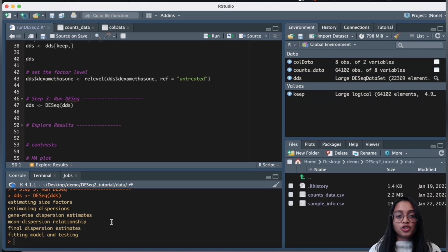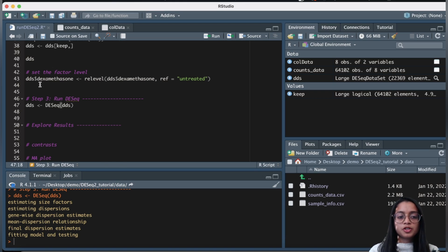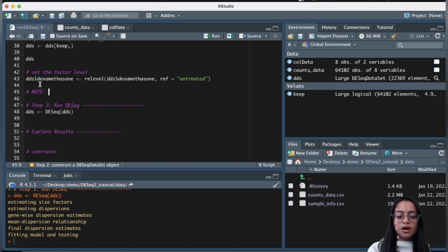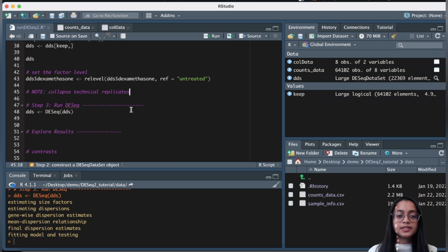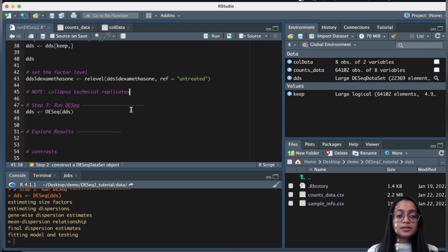Before we explore the results, I want to make a note about technical replicates. If our dataset has technical replicates, we need to collapse them before performing differential expression analysis. DESeq2 provides a function called collapseReplicates to do this. Please make sure you are only collapsing technical replicates and not biological replicates — you should never collapse biological replicates.